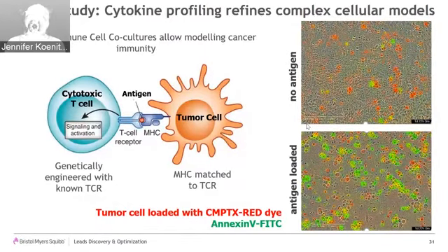In the bottom case, we have added the antigen to the co-culture, and now the tumor cells can be recognized by the antigen-specific T cell, be activated and killed, which means during the co-culture, you can actively monitor the lysis and the killing, and basically the disappearance of the red tumor cells and the increase of clustering of dead cells in those green clusters that I'm showing there, on the right-hand side at the bottom.